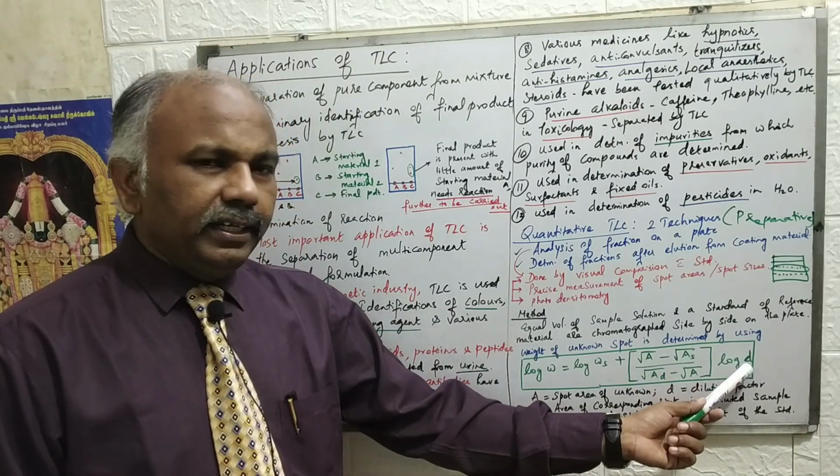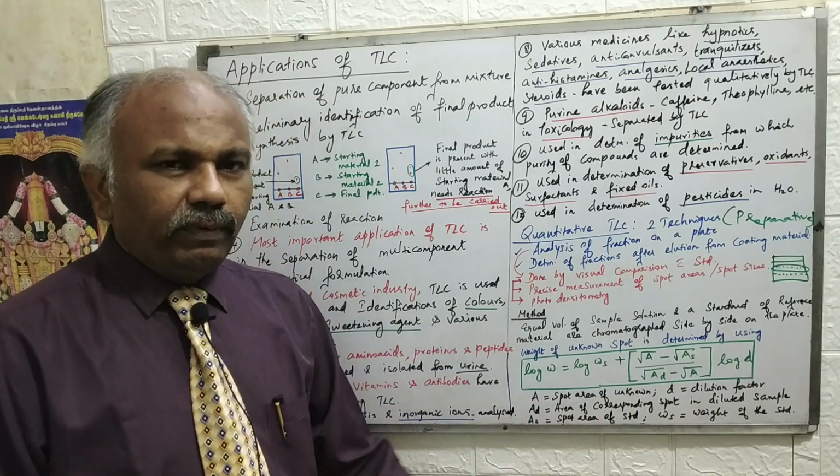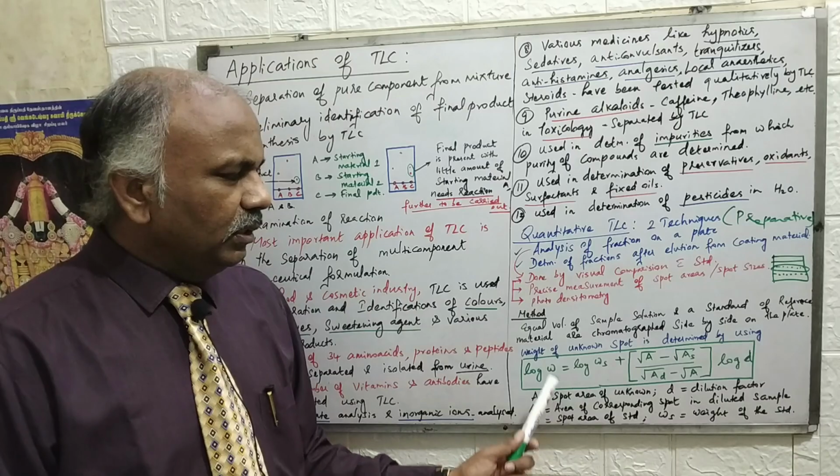And what is log D? D refers to the dilution factor, right? So this is the formula we are using to calculate log W.